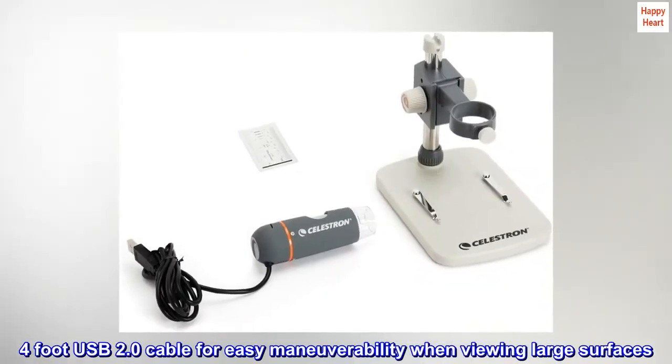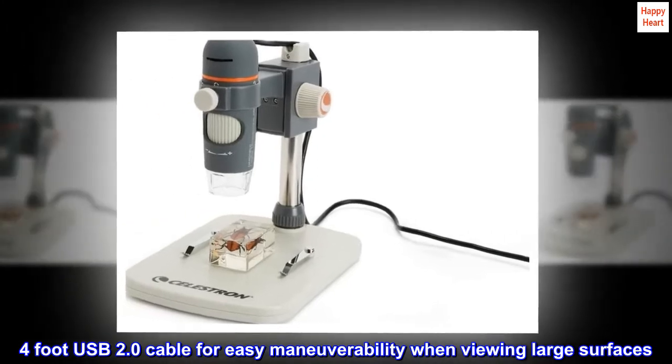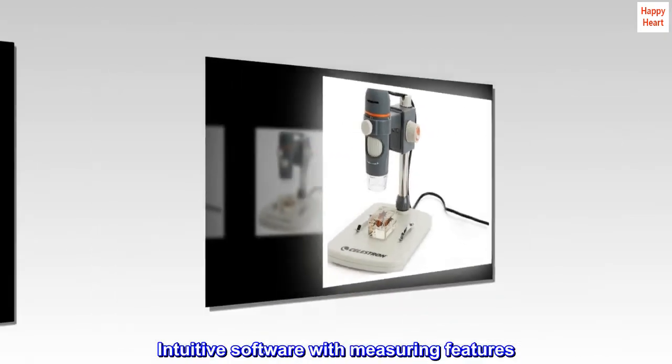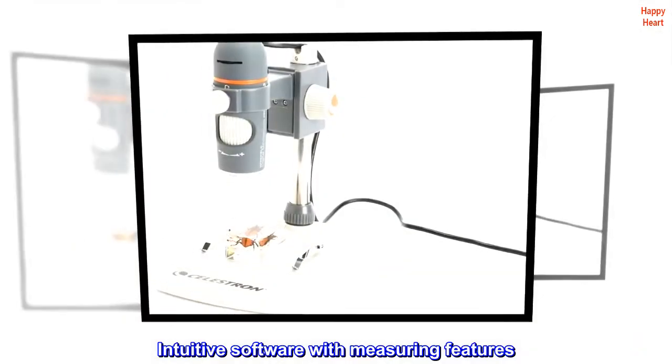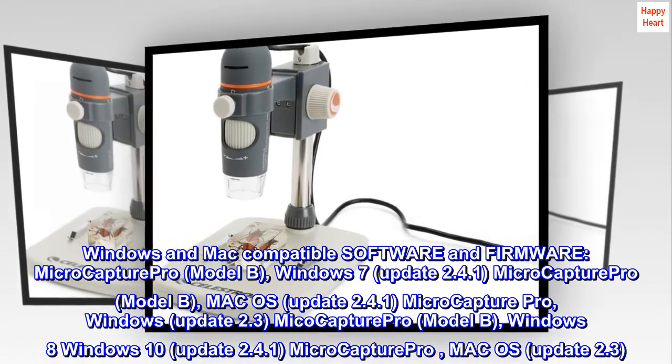4-foot USB 2.0 cable for easy maneuverability when viewing large surfaces. Intuitive software with measuring features. Windows and Mac compatible software and firmware, MicroCapture Pro.